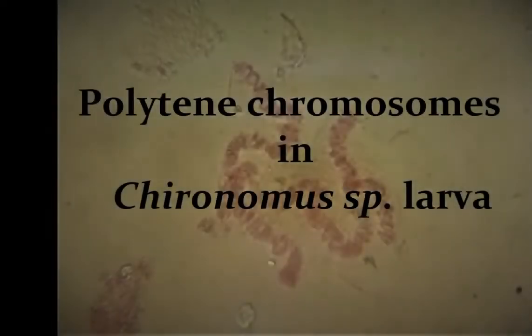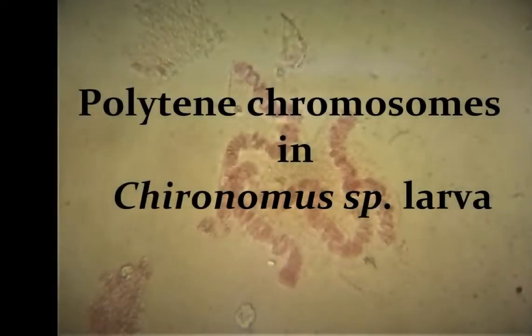Polytene chromosomes, or giant chromosomes, are unusually large chromosomes formed as a result of repeated rounds of DNA replication without cell division. The sister chromatids produced thus stay fused together. This type of repeated division of the chromosome in the absence of cytoplasmic division is called endomitosis.